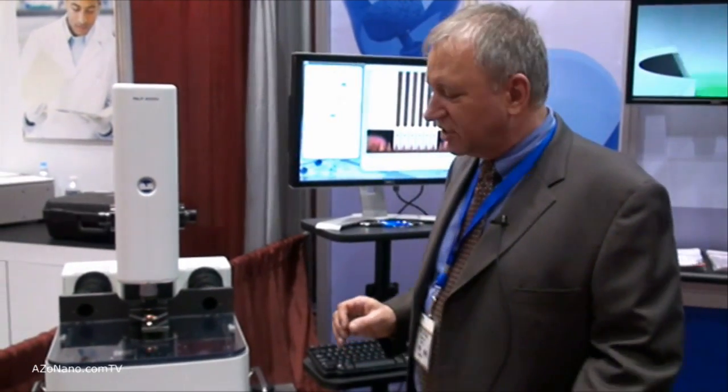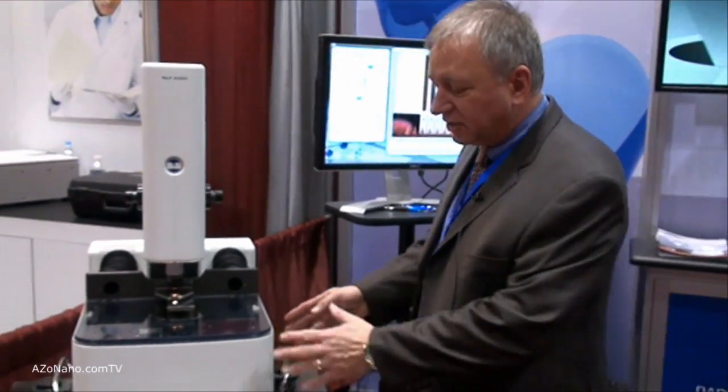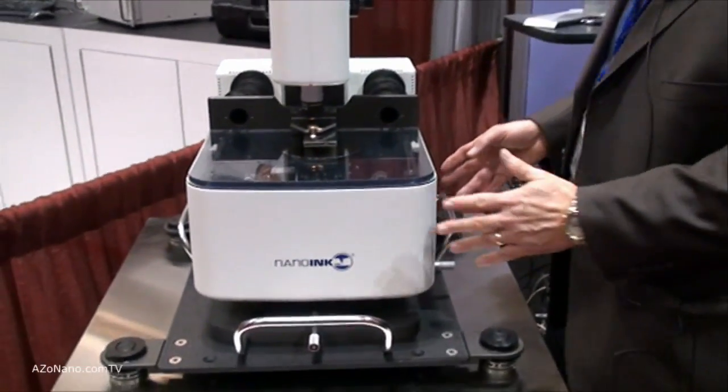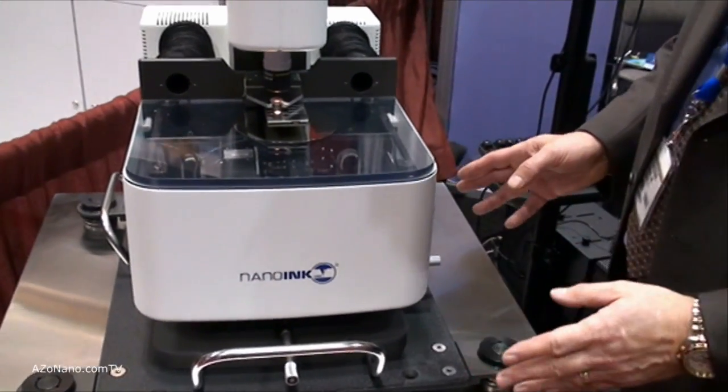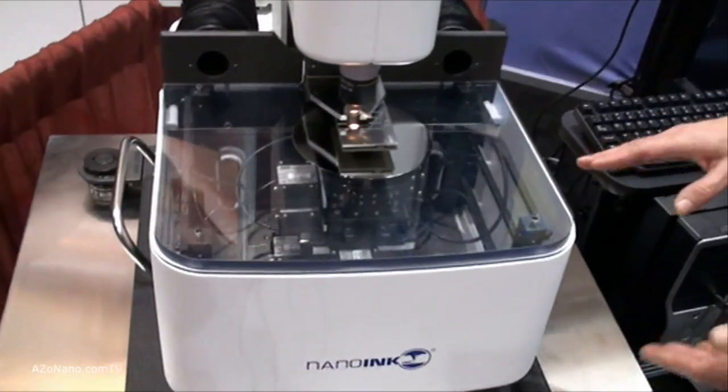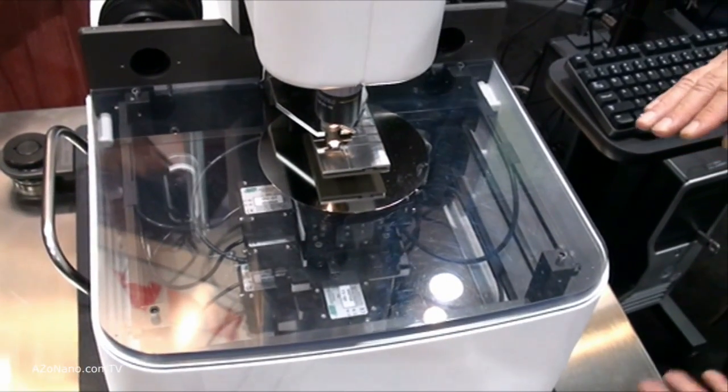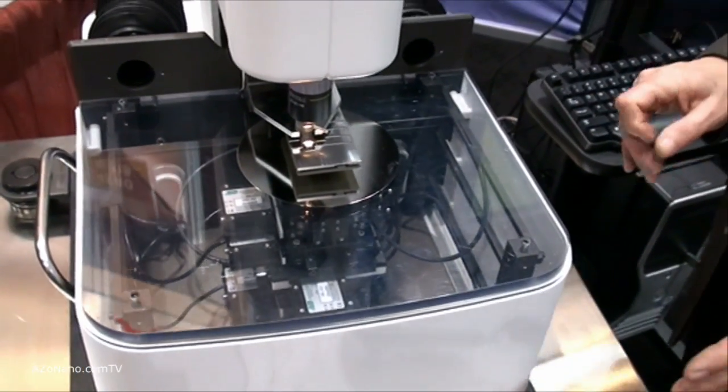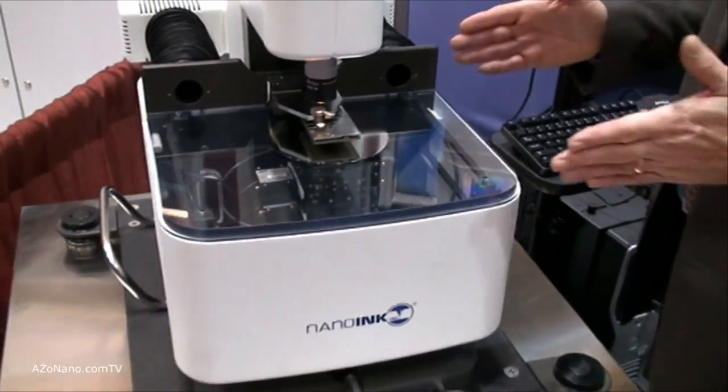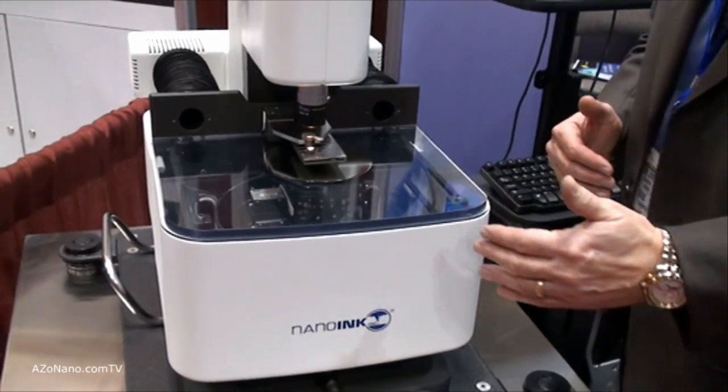Down here, we have the staging. It is a five-axis nanopositioning stage. There are a series of nanopositioners that allow you to move with resolution as small as 5 nanometers over a 40 millimeter by 40 millimeter area.